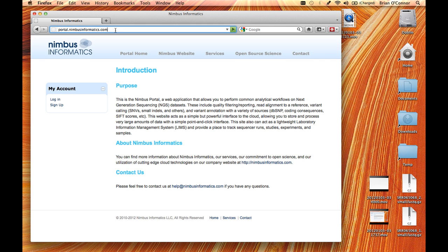Nimbus is a consulting company that specializes in helping researchers analyze their next-gen sequence data on Amazon's cloud. This is the third part of a three-part series of video tutorials on how to analyze data through our Nimbus portal web application. In the previous two videos, I showed you how to set up your studies, samples, and experiments in the portal, and then I showed you how to upload data and associate it back with those samples through the web application and using our upload tool for transferring data into the cloud.